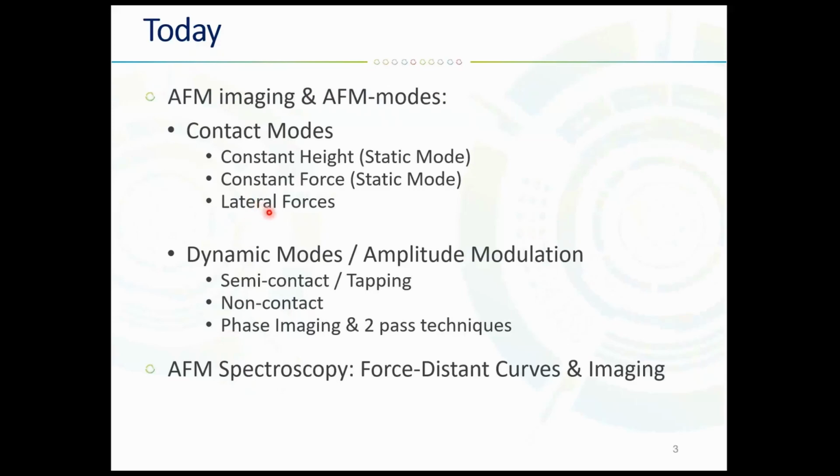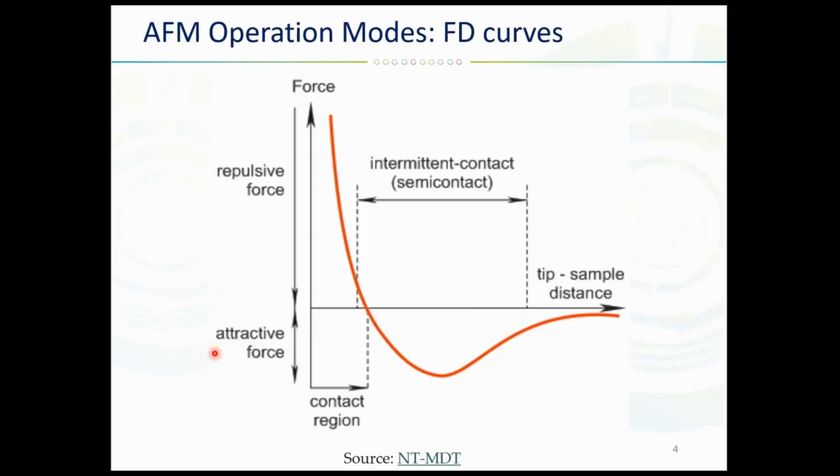Lateral force AFM, I mentioned a bit about this mode last time, but again today will be more details. And also we'll talk about dynamic modes or oscillatory modes, or another way to call the same parameters, amplitude modulation. We'll be covering tapping, non-contact, and phase imaging. And also I will bring you some examples of each mode so you can understand where it can be used.